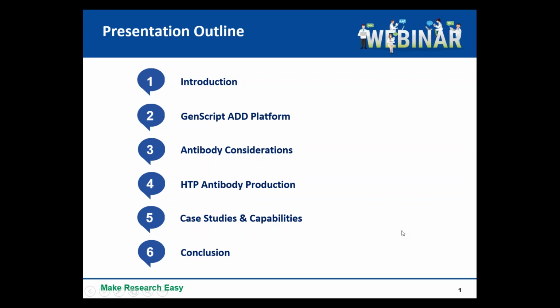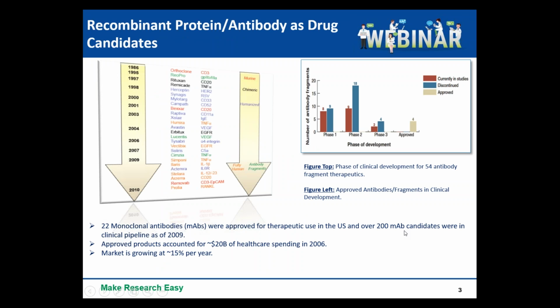Okay, so with that, the introduction. Essentially, this slide captures the sense of what was done so far in this last decade in terms of large molecules, most of them antibodies. If you look at the figure on the top left-hand side, these are approved antibodies and or fragments in clinical development, many of them approved. If you look at the red ones, they're murine, and the black ones are chimeric, the blue ones humanized, and then the orange ones are fully human, and the green ones are antibody fragments, going all the way from 1986 until 2010.